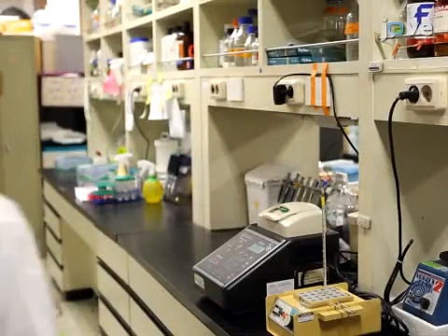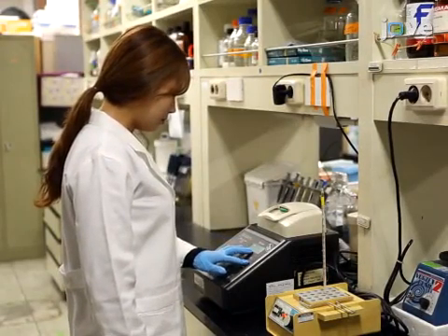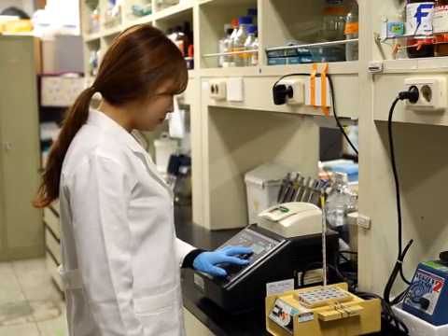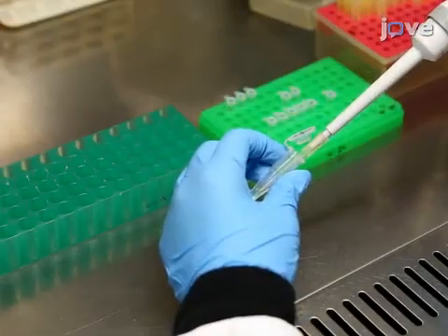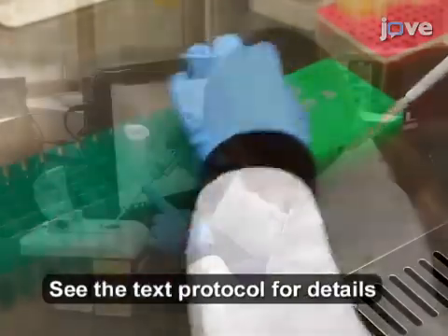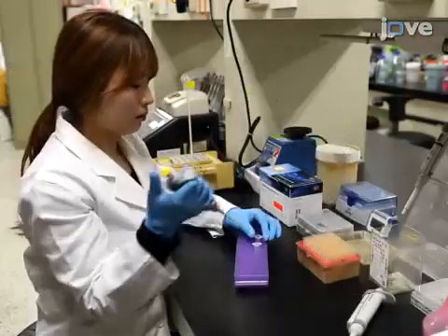To make the ubacteria probe, use a 70 base pair DNA fragment as a template and two 15 base pair primers to amplify the probe by PCR. Collect the amplicon in buffer at a known concentration, then label the probe with a DIG DNA labeling and detection kit.